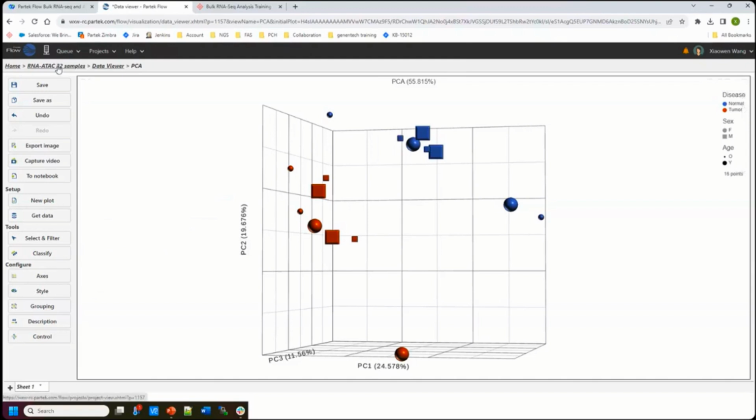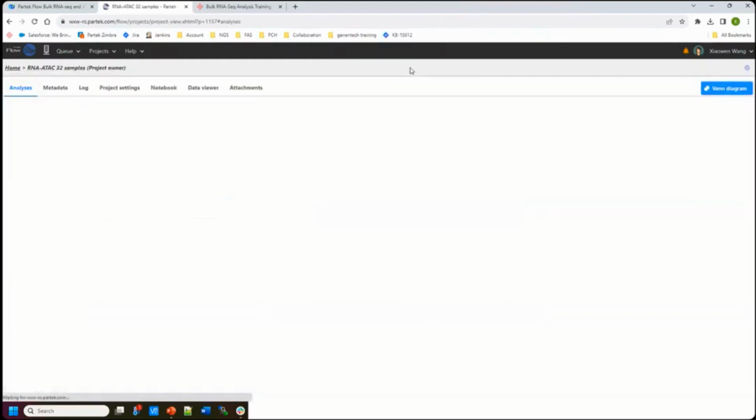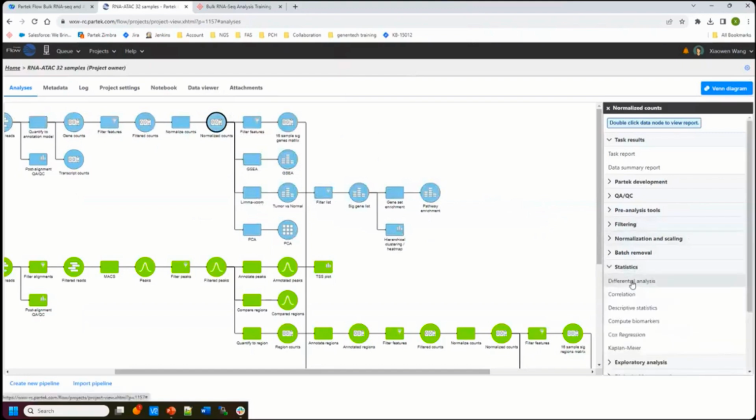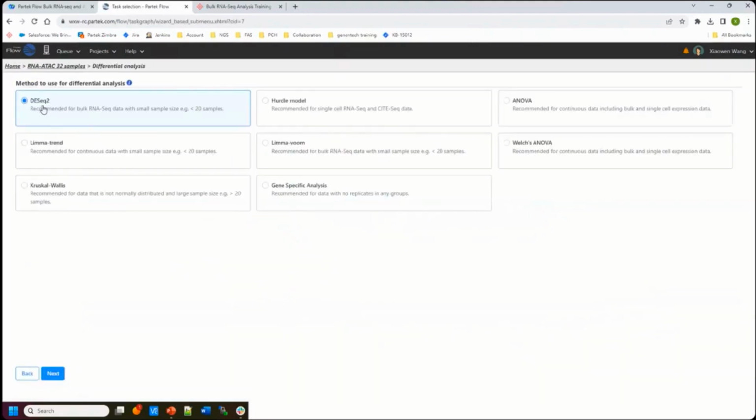Okay. Now we're going to perform differential analysis. Since I used a different normalization method, I will use limma, which is another popular differential analysis method. Our recommendation is using DE-seq, but then you should use the DE-seq normalization. Here, since I used TMM, I like to use limma. It has shrinkage, which means it borrows variance from other genes, so it is good for dealing with a small number of samples.